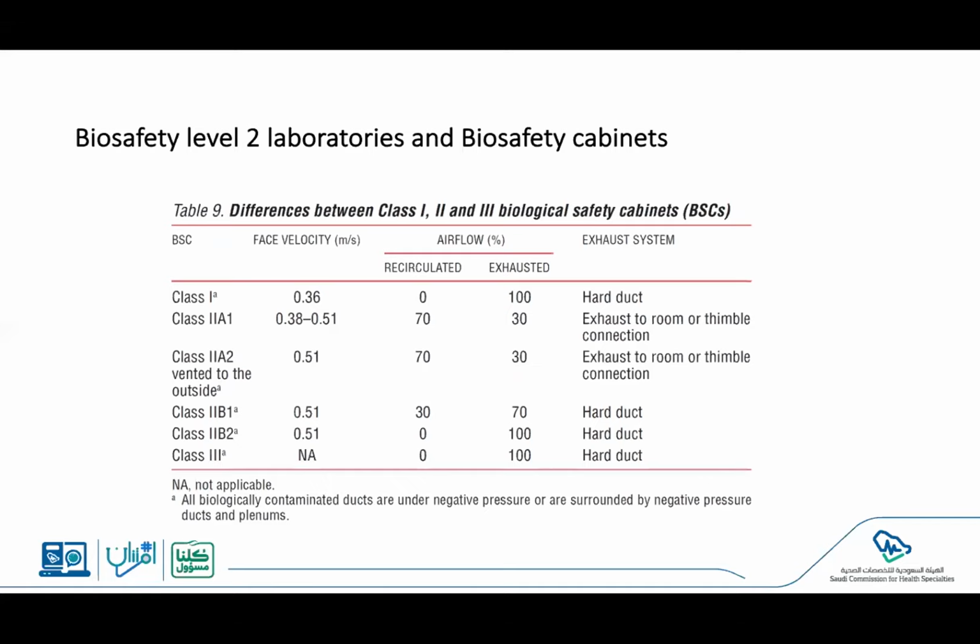But that can cause anxiety, probably for laboratory practitioners. And that's why biosafety level 2 B2 is the one that is usually utilized. However, it's quite difficult.